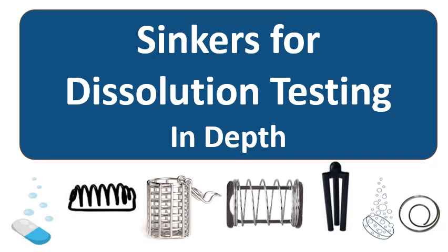Also, in the last part of this topic, we will discuss the best practices whenever we are using the sinkers.